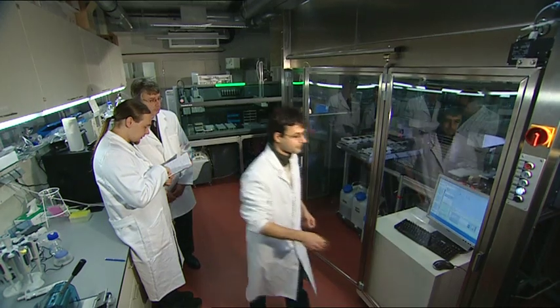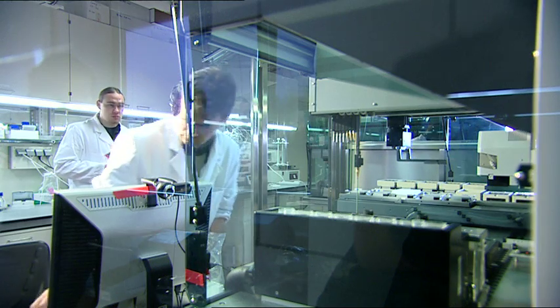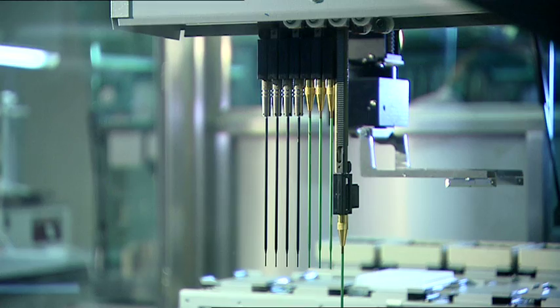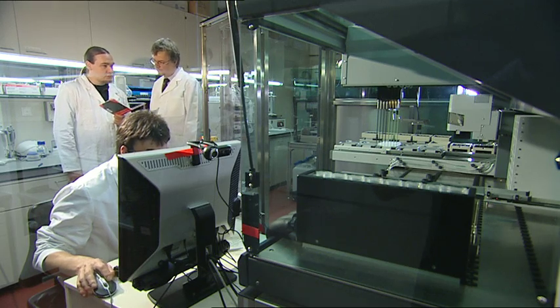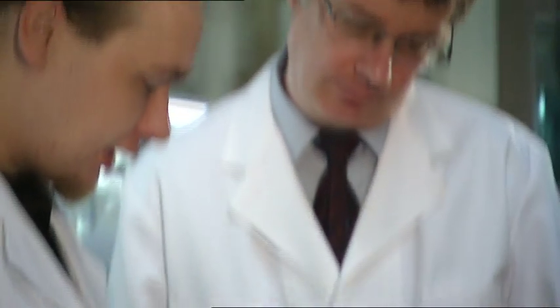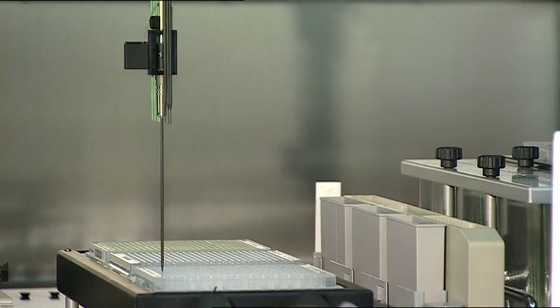At the Leibniz-Institut for Molecular Pharmakologie, Dr. Jens-Peter von Kries and his team have established an exceptional laboratory for large-scale automatic experiments. The so-called screening unit is the main technology platform of the German Initiative for Chemical Biology, ChemBioNet. By linking biological and chemical methods, Dr. Kries and his team help to find out the function of proteins. They support academic research projects looking for new active ingredients.